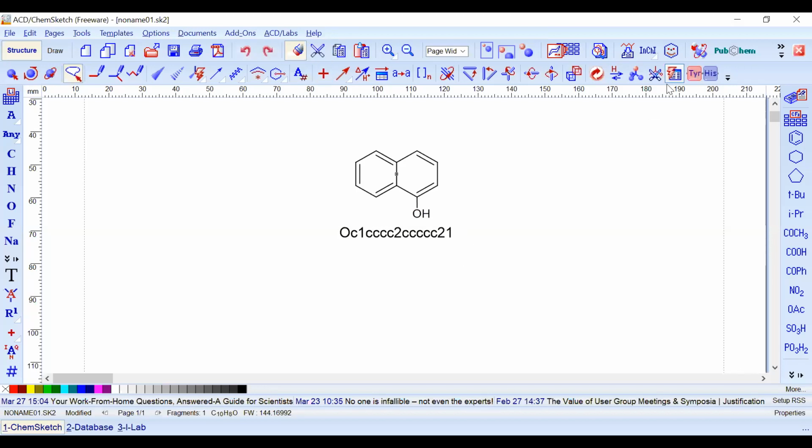So this is one way of understanding and representing the arrangement of atoms in the molecule, what we have drawn over here. There are so many other features also. I will give one interesting feature to everyone. Once you have drawn the structure, you want to view it in the 3-dimensional viewer. So let me show you this feature also, how you can do that.